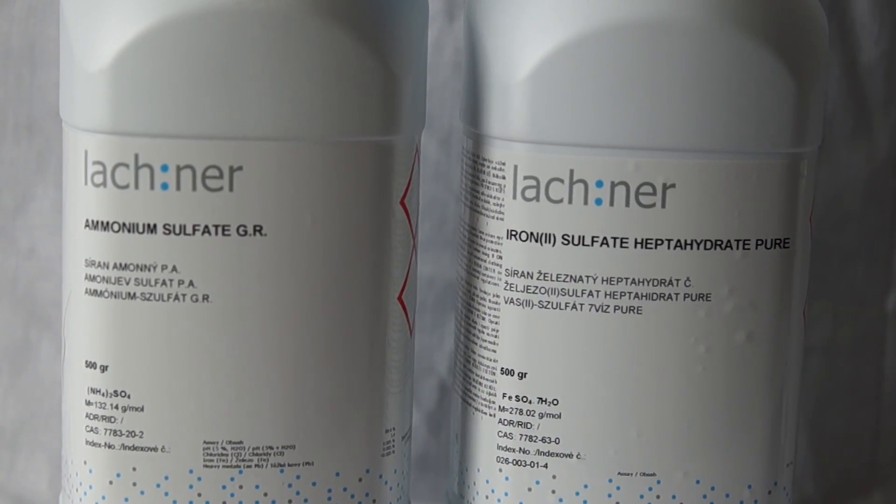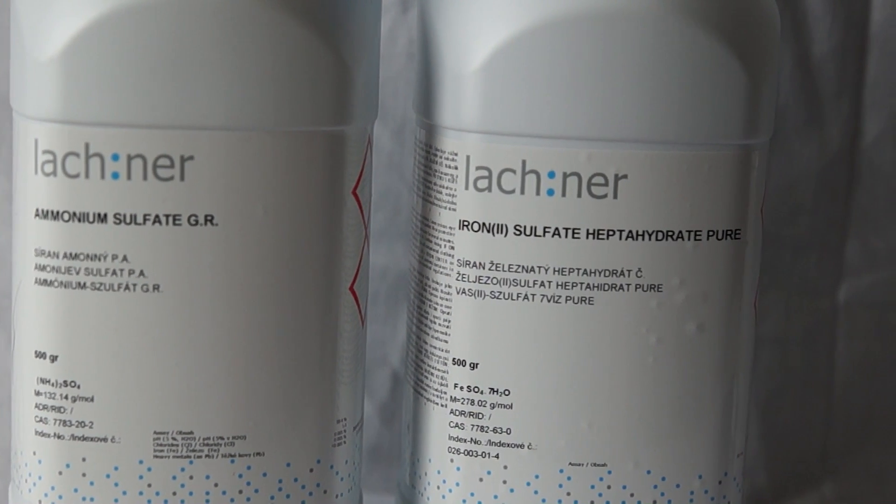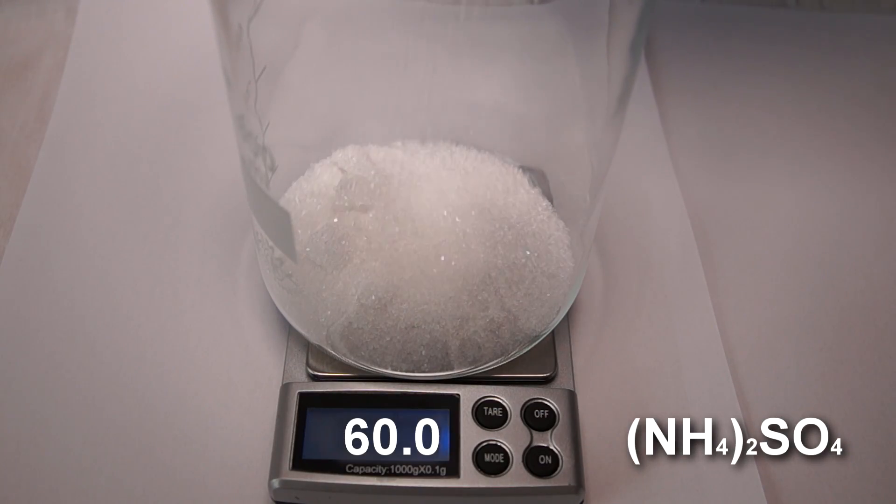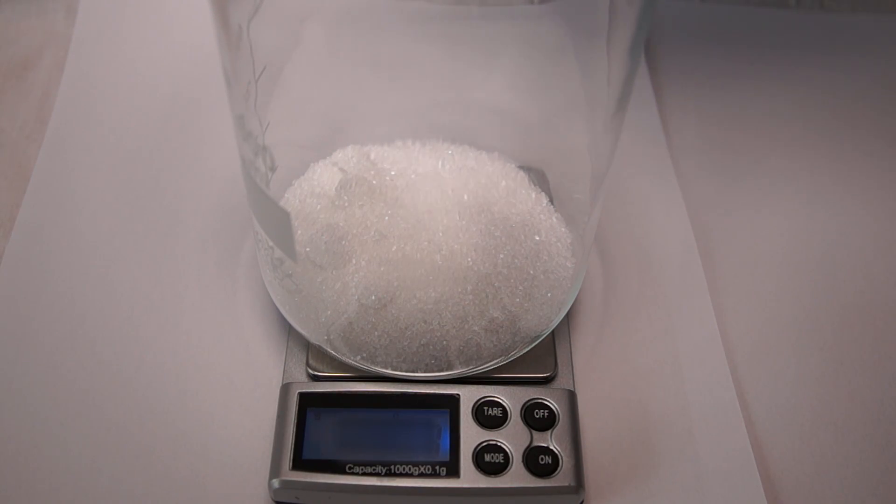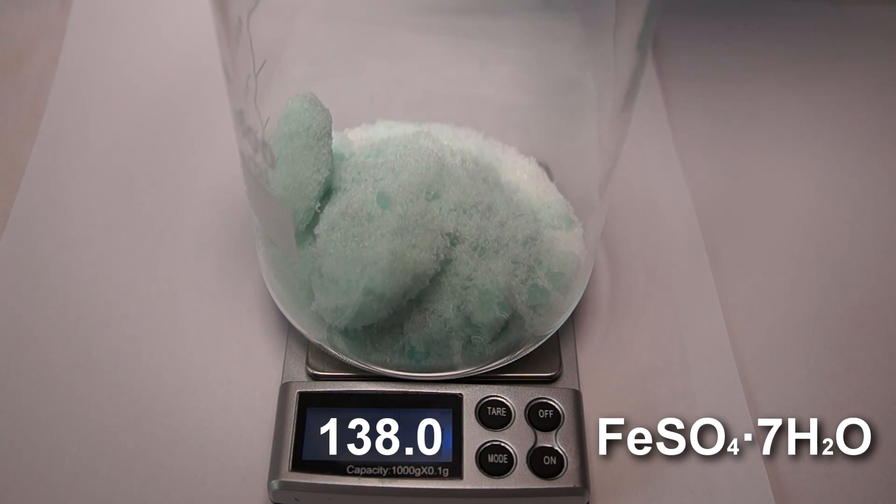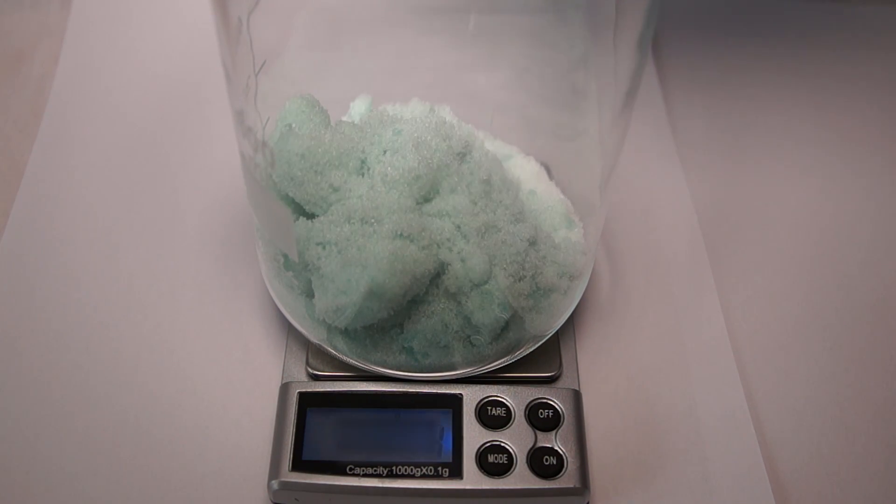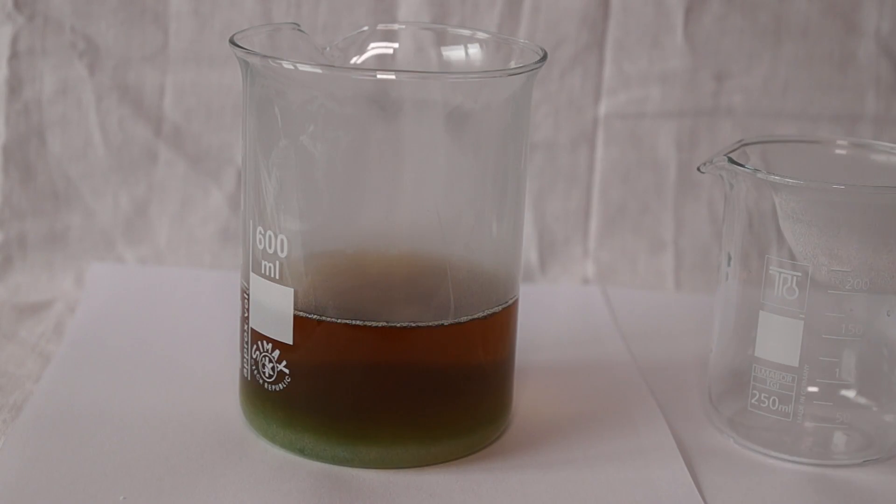Take a large glass and weigh 60 grams of ammonium sulfate and 138 grams of iron(II) sulfate in it. Next, add 400 milliliters of very hot water to the mixture.